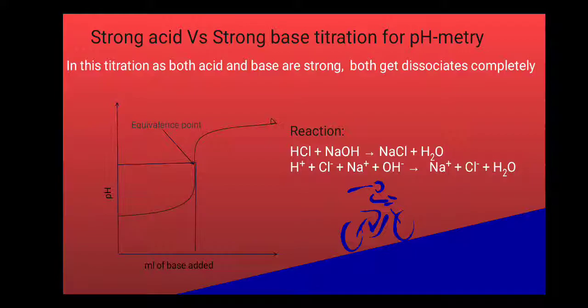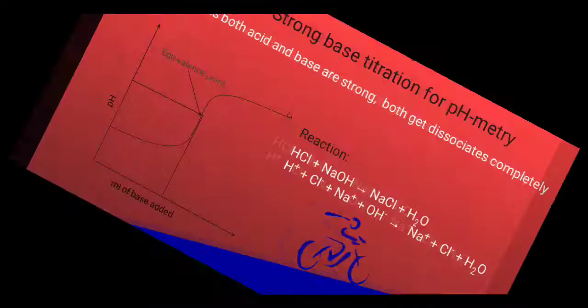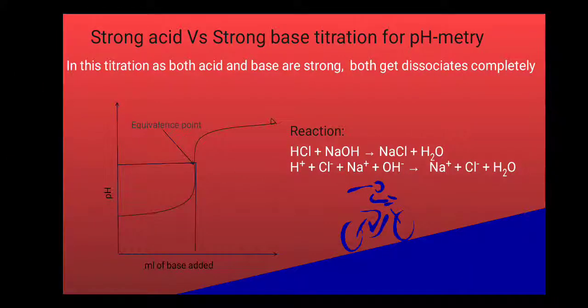So when you start adding base from the burette, the pH starts increasing.